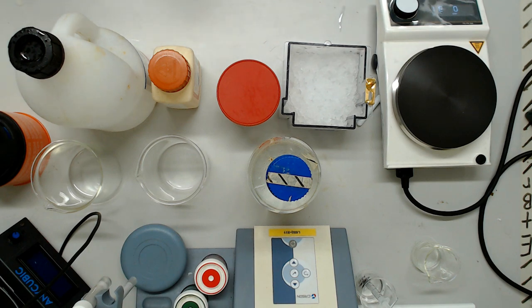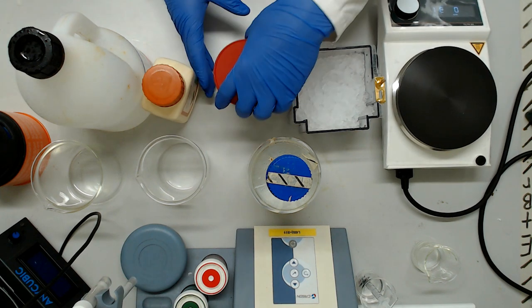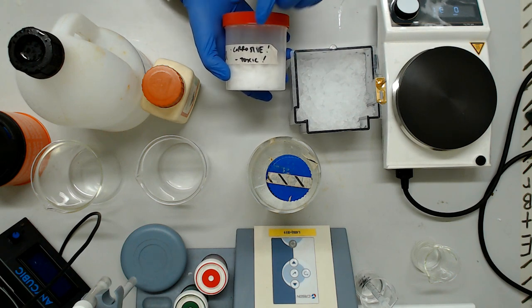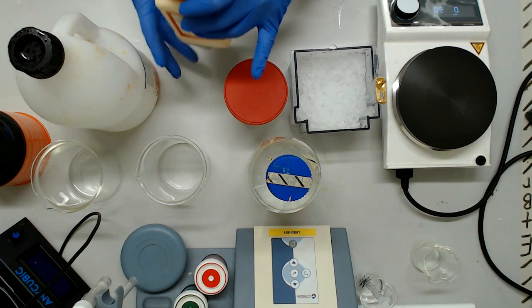Hello and welcome to video number 3 of our mini prep buffer mixing series - the one where the reagents cross over from kinda dangerous to melt your flesh off in chunks nasty. To recap, these protocols were handed down to us on fragile parchment from the library of Coleman, who himself translated them from the ancient runes inscribed on openwetware.org.